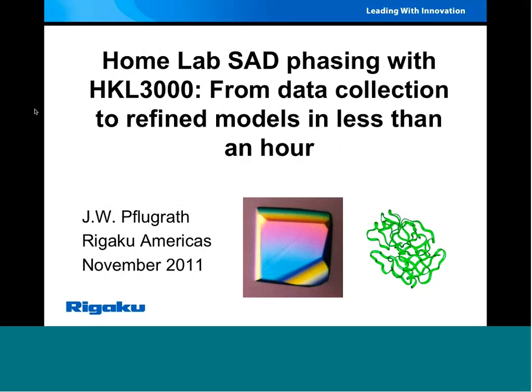This should also be useful to all of you past today, because if you have to teach somebody in your group or your lab how to use HKL to process data or to do phasing and display models, then you can just say, well, go to the Rigaku webinar and watch this, and that will save you a lot of grief, because they can watch this first, and then they can ask you questions, and you can explain things to them.